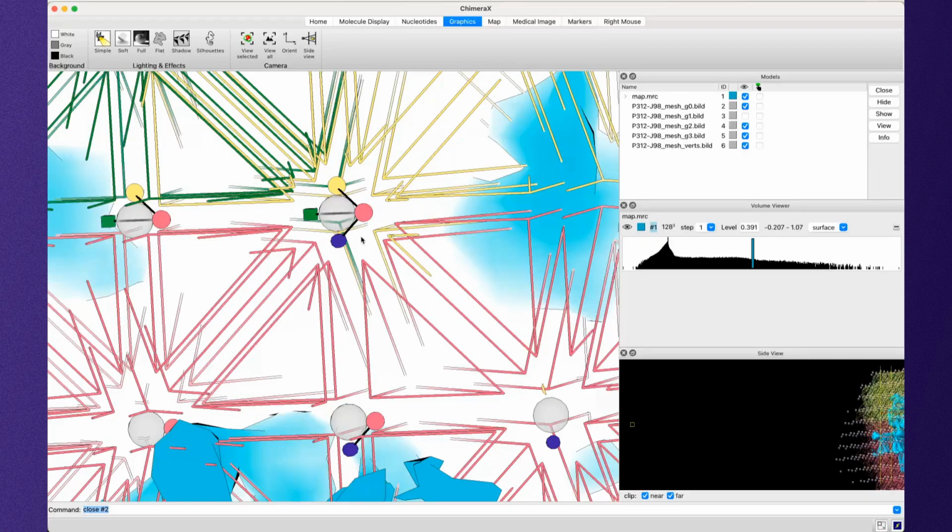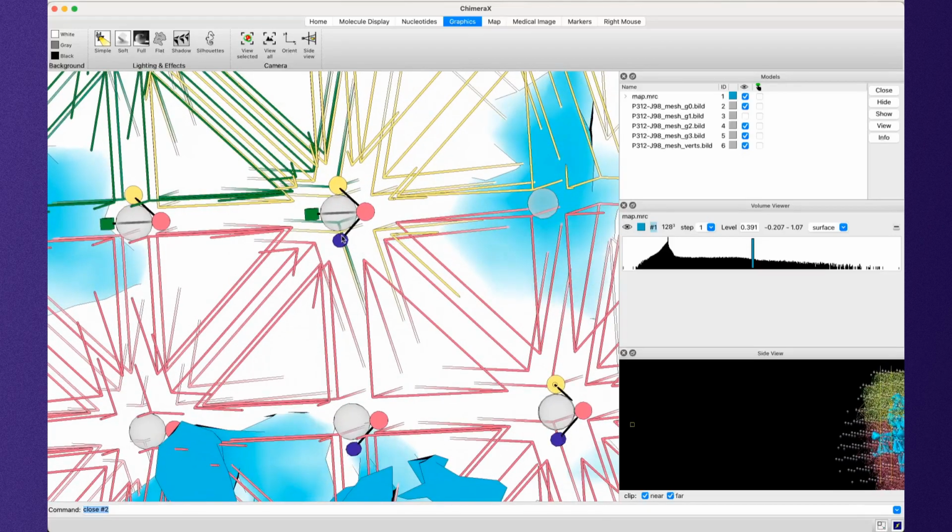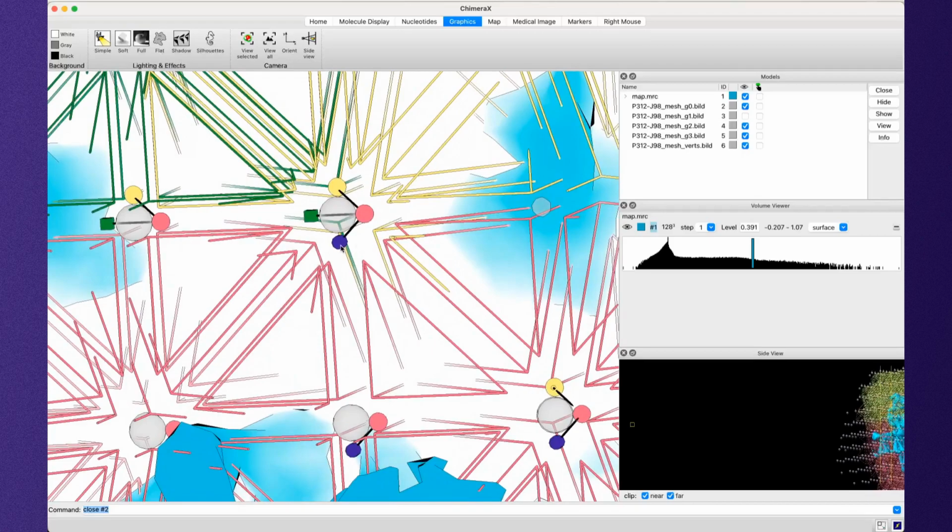And this is really important because let's say that we had marked the micelle as rigid, right? Let's say that we had said, I don't want my 3D flexible refinement model to try and figure out what's going on with the micelle. Let's just treat it as a rigid object. Well, if it was rigid for the micelle, then it wouldn't be allowed to move. Or it would be allowed to move, but it would be very expensive, right? The model would have to really be explaining a lot of information to move it. So it would become very challenging to move purple's copy or blue's copy of this vertex. But the problem is pink's copy of this vertex must be in the same position as purple's copy because they're fused. And what that means is also the fabs would have to have the same position as the micelle.